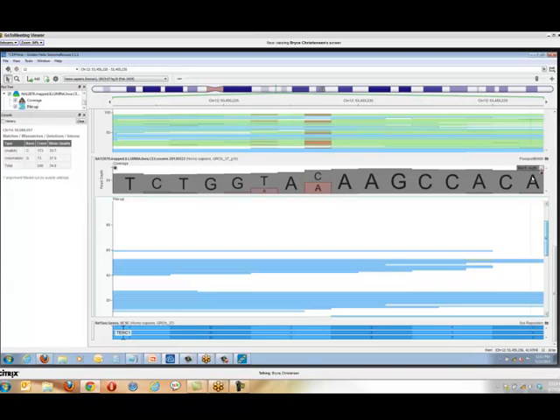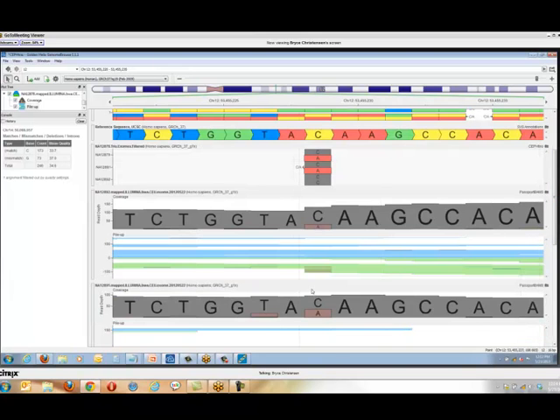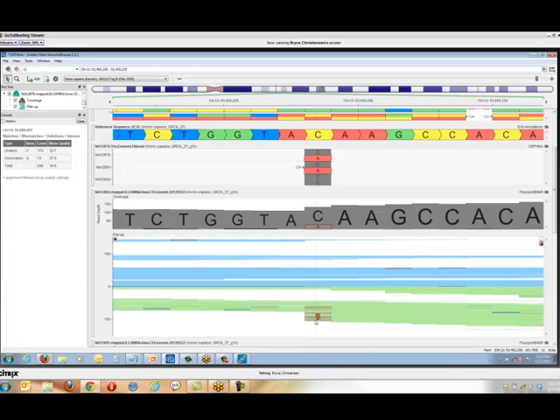But then we can come up and look at, for example, this first parent. We see the same thing. Pretty low overall proportion, nothing in the forward strand, and on the reverse strand, generally called with low quality. So it's hard to know when you see something like this. Your caller might say, this looks like a de novo SNP. If you go back and look at it, there is some evidence that either the parent has it or that really nobody has it and it's just a sequencing artifact because of this low quality. Just something that's weird and hard to know exactly what's going on.